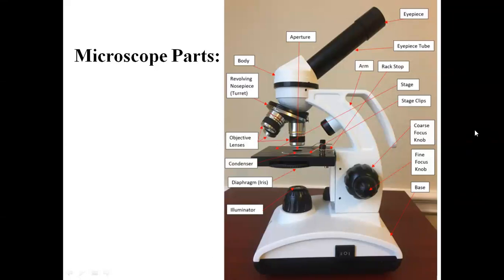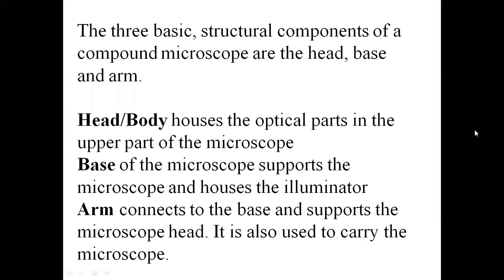As we see, like a general microscope, every microscope will have three basic parts. The three basic parts of your microscope are the head portion, the base portion and the arm portion. So three different parts of any microscope, whether it is a stereo or compound.